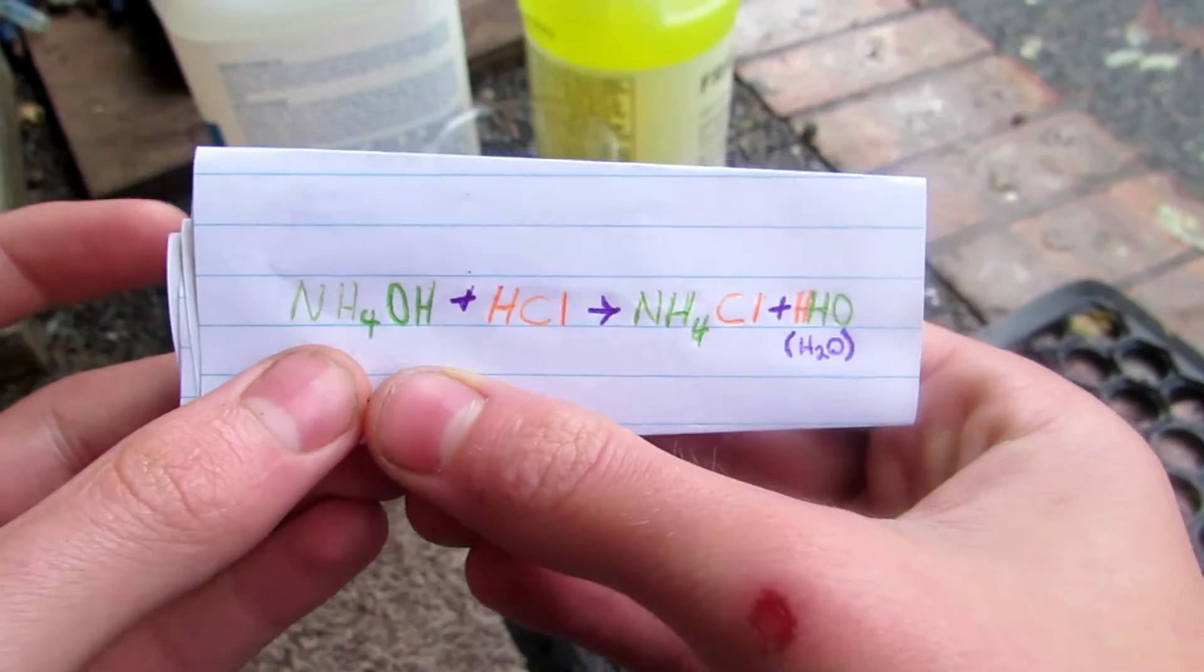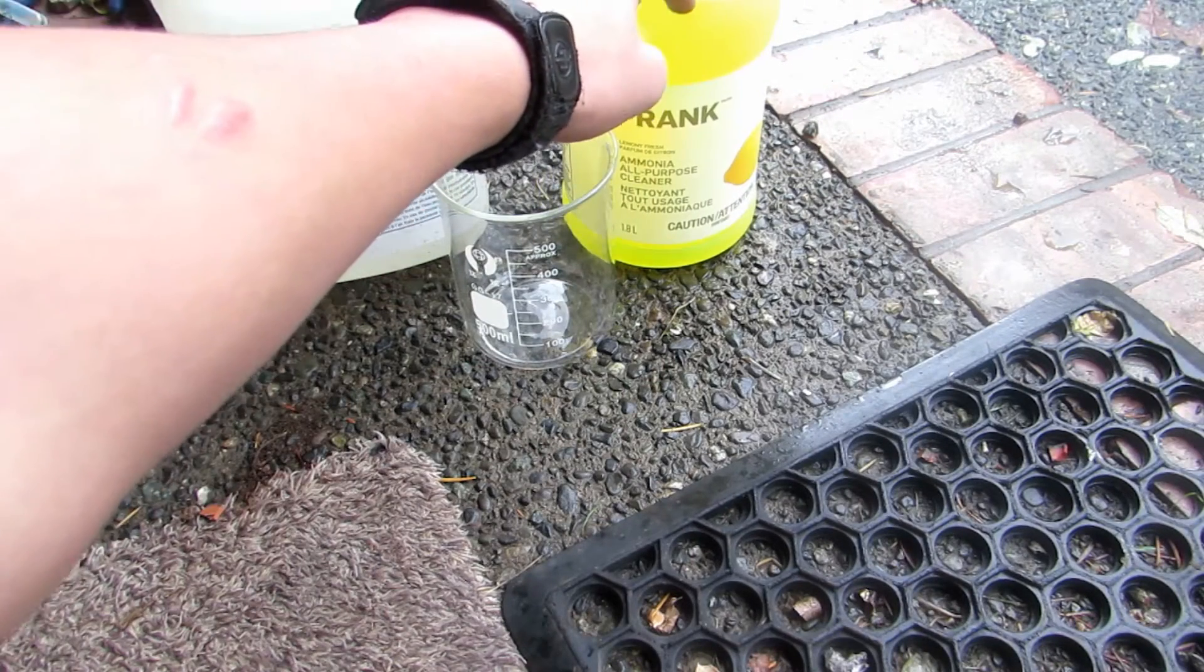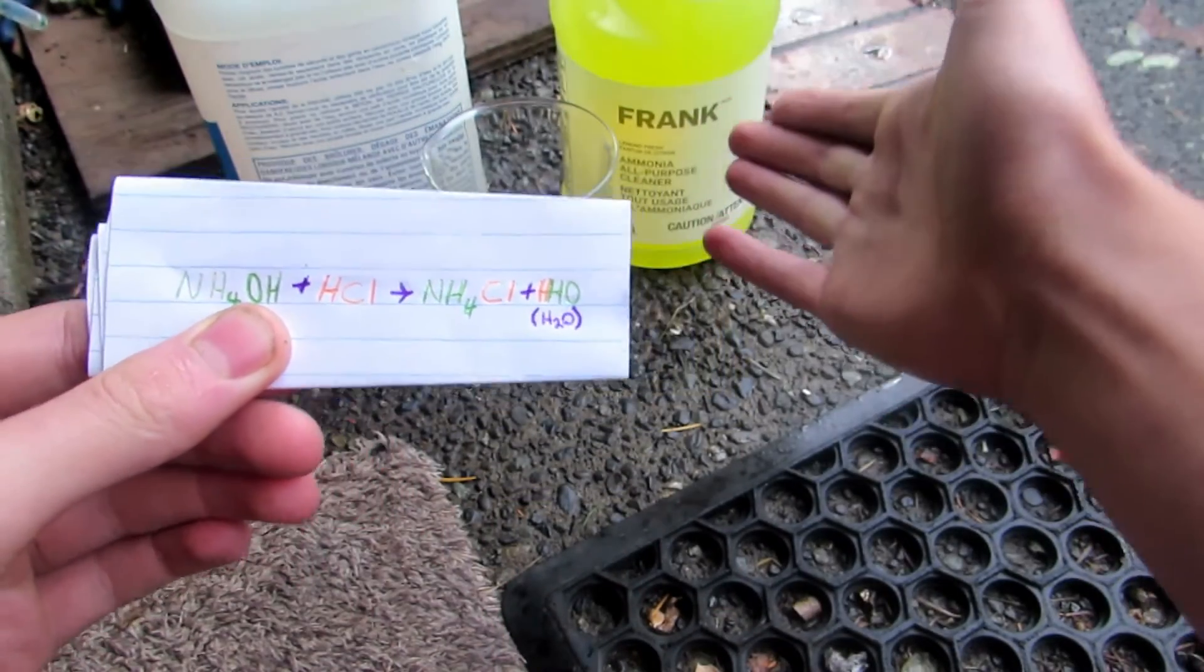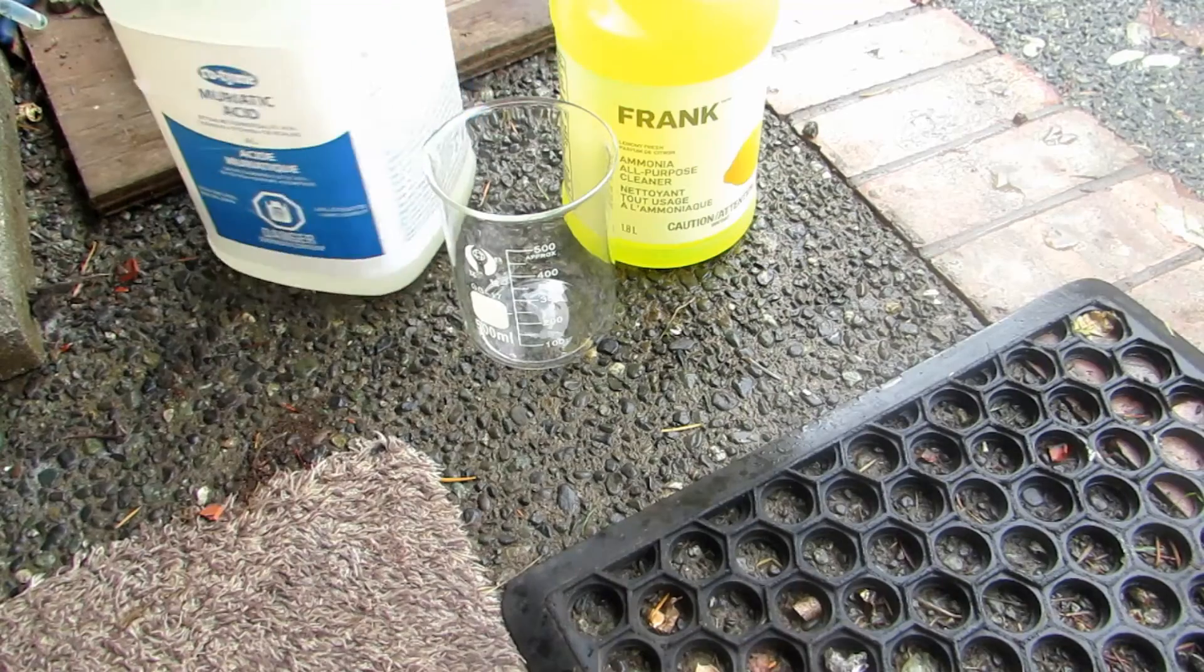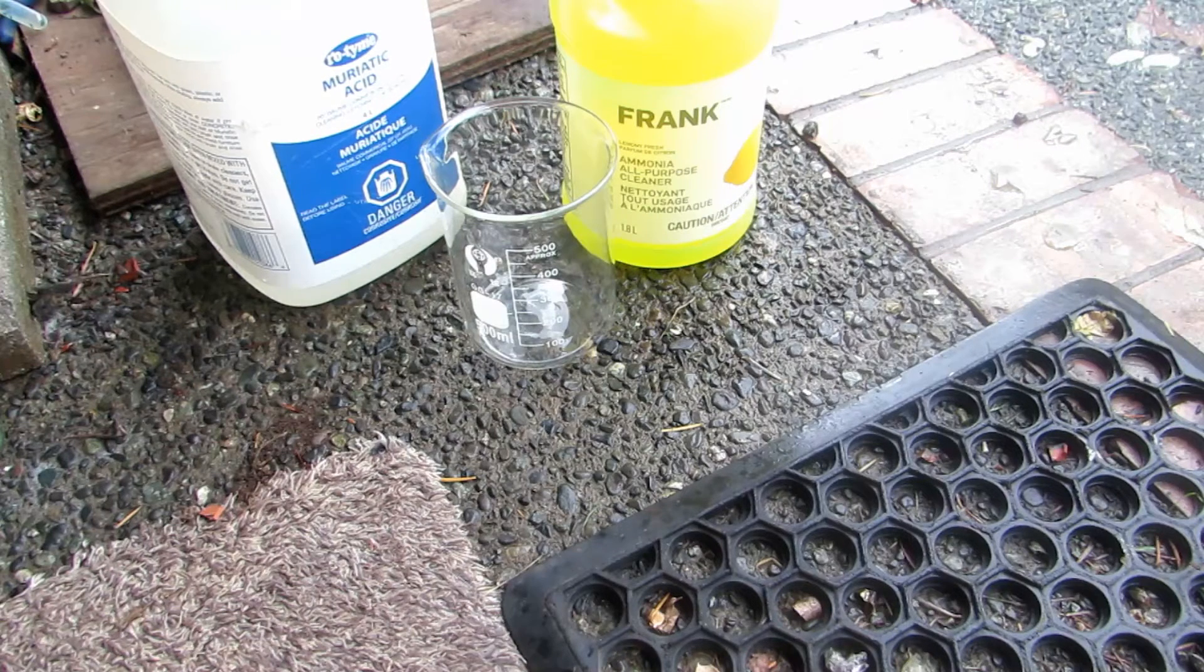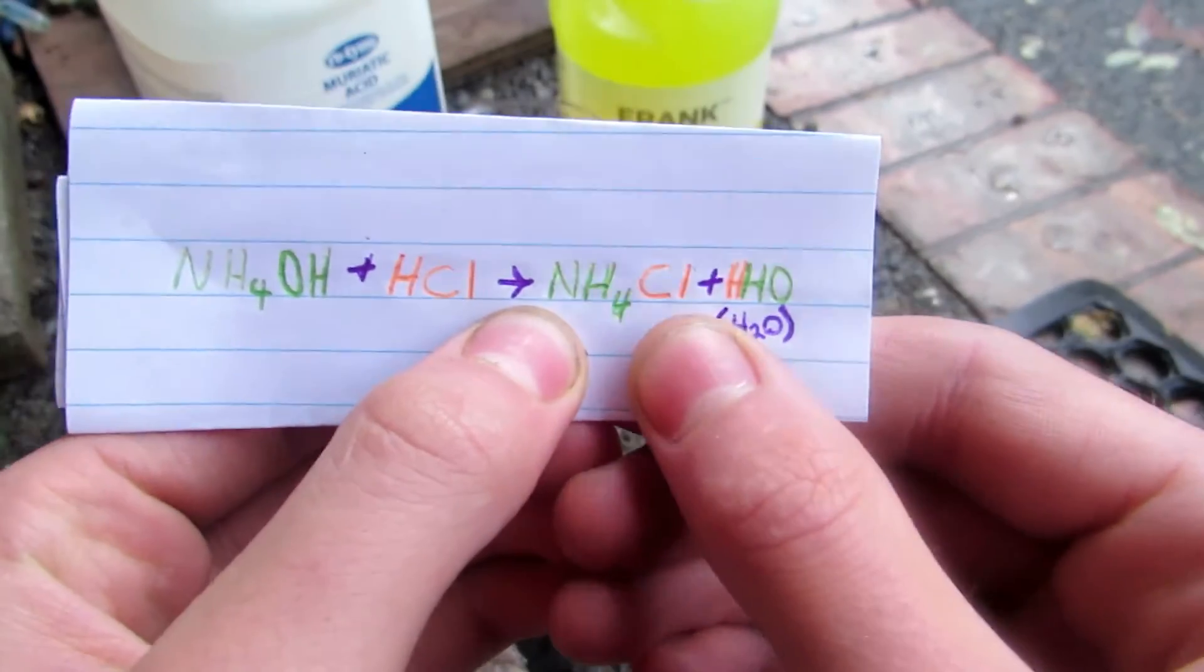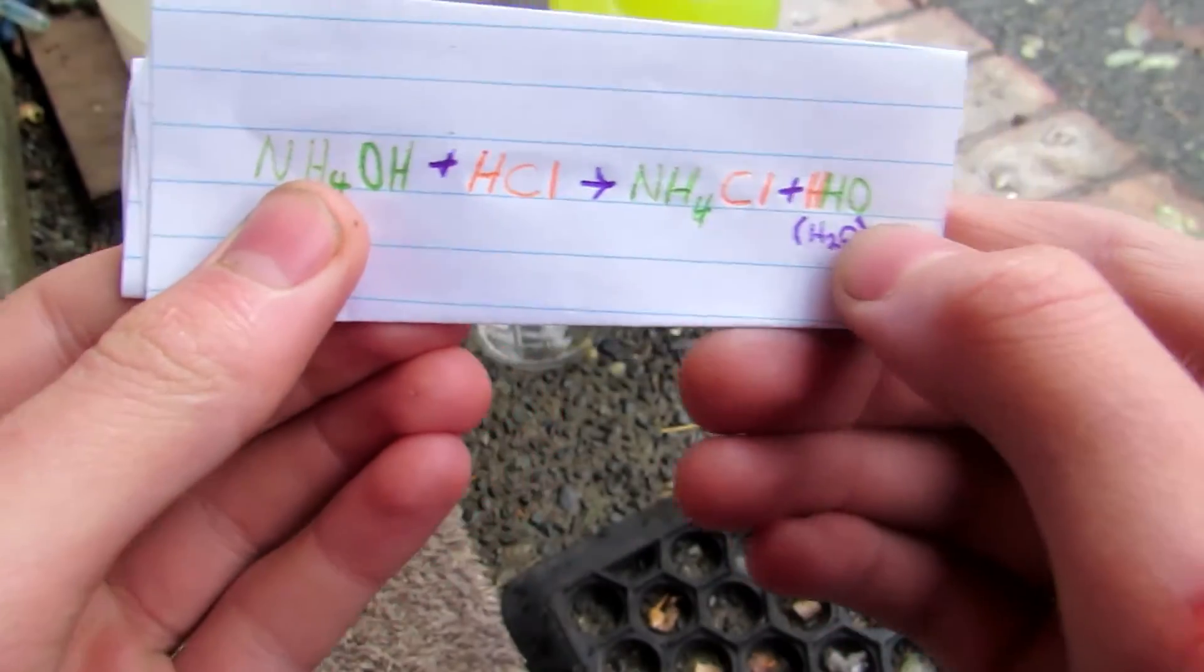The reaction that we're going to be following today is ammonium hydroxide, which can be sold as household ammonia. It's best to get the clear stuff, but I could only find this lemon scented stuff. That's fine because we're going to be doing a recrystallization and we'll get rid of all that yellow color. We're going to be reacting the ammonium hydroxide with hydrochloric acid. This is sold as muriatic acid, hydrochloric acid with a concentration of 31.45 percent, which is approximately 10 molar. This is then going to produce ammonium chloride and water. It's essentially just water, H2O.